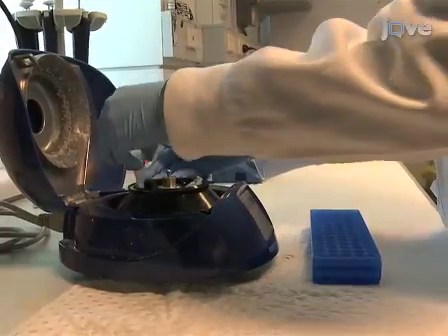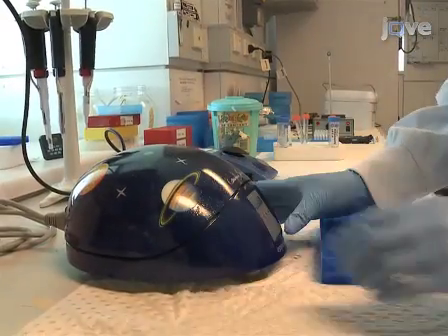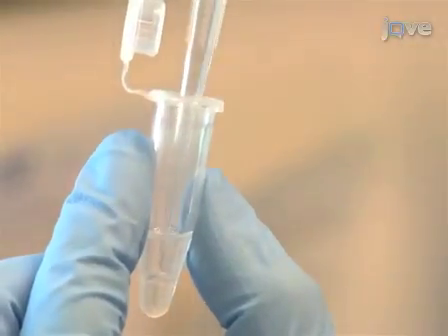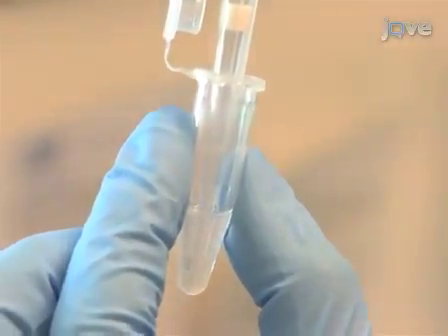At the end of the appropriate incubation time, spin the tubes briefly in a microcentrifuge to ensure all of the liquid is at the bottom of the tube. Then carefully pipette out the DNA solution from the bottom of the tube without taking up any of the mineral oil.